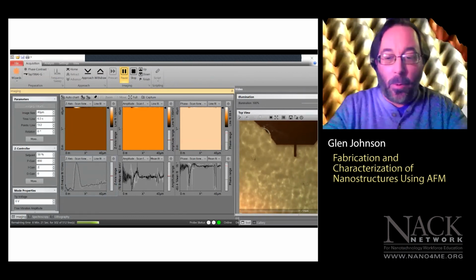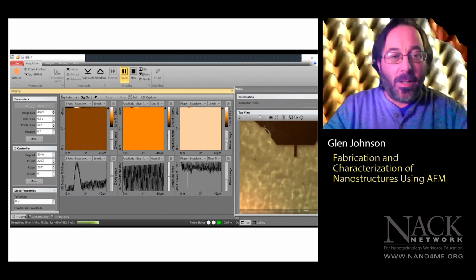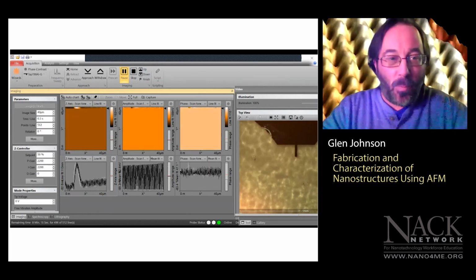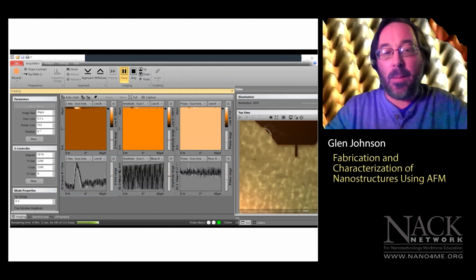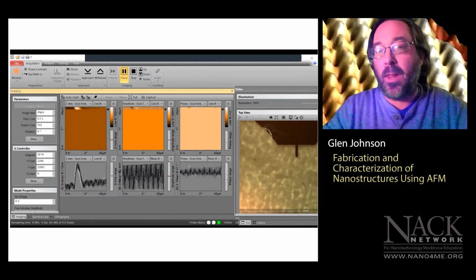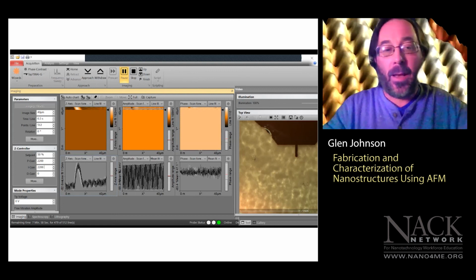I'll just show you a quick example. Let's say I just hit 2200, so that's what we'll try. You can see if I move it to 2200, that's not very smooth. That's going to give us, well, actually a horrible image. So I can adjust these gains and manipulate that to smooth this out. And hopefully you can see, especially on this amplitude, we have a lot of noise coming in. That's not really part of the sample. So we want to eliminate that while keeping our resolution and smooth this out.